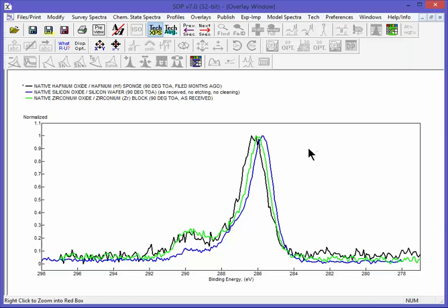There is a reason for these differences. The reason is that surface dipole moments of highly polarized materials have a bias that affects just the carbon, which is at the very top of the overlayer system. That's some physics that would require a special training lesson.